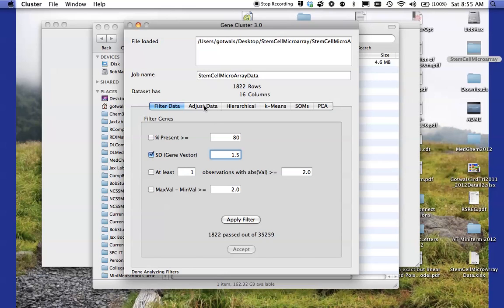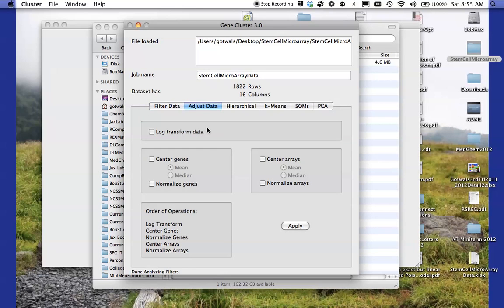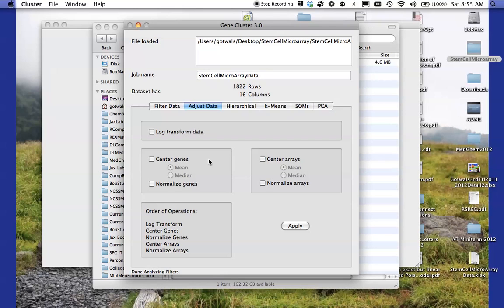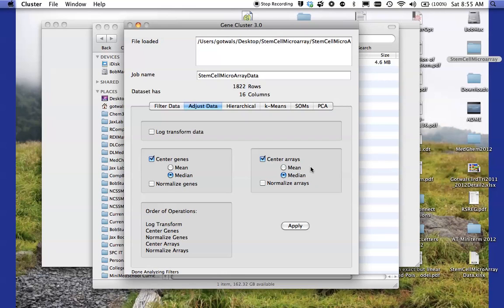Now what I want to do is I want to adjust the data. And as it says in the case study, what you want to do is what's called a median centered data adjustment. And you should read the example in the case study so you understand what mathematics is being done there. I'm going to click on center genes and I'm going to click on median because I wanted to center the genes based on the median of the gene data. I'm also going to center the arrays as a median centered array. Again, you should read about what median centered means. You're going to see that a fair amount during the course. And I'm going to apply that. And notice at the bottom it says done adjusting that data. So I have filtered the data. I've adjusted the data.